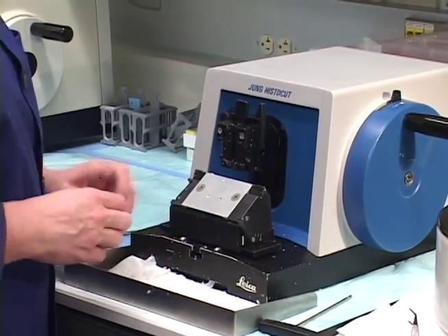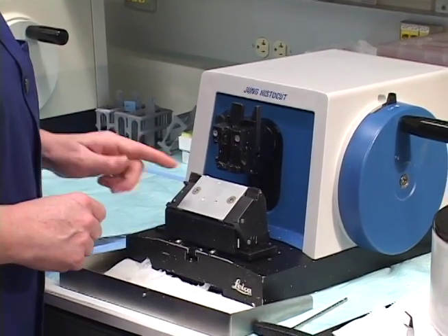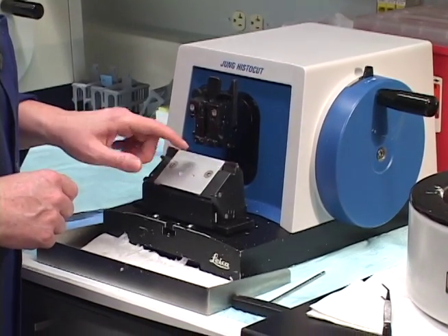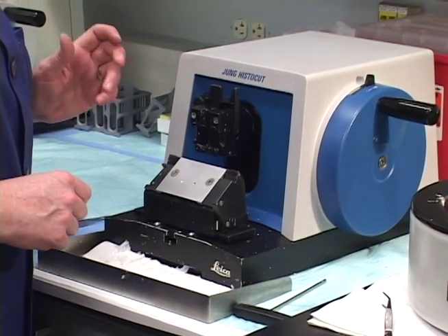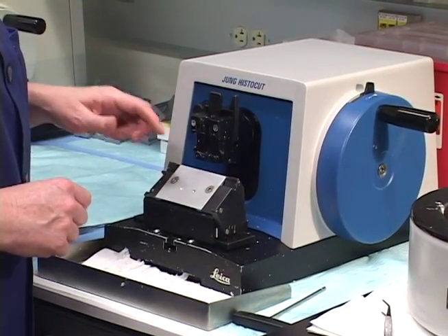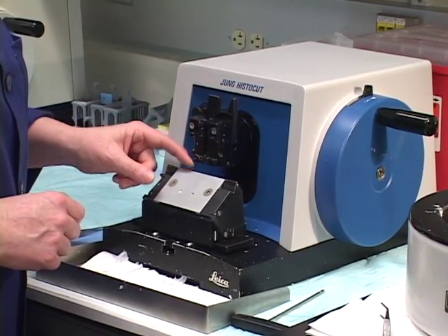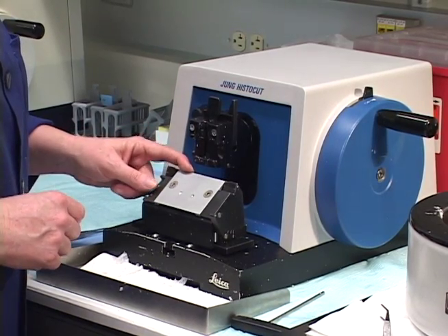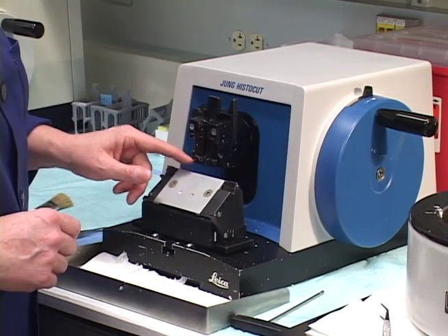Now I don't know if you guys are going to want to remove this routinely or not. It's pretty calibrated, this knife edge. So if you do remove it, be darn sure that you don't drop it, ding it against something or whatever. Because one nice ding into this edge here and it won't clamp the blade correctly, and you won't get a ribbon on that edge ever again.